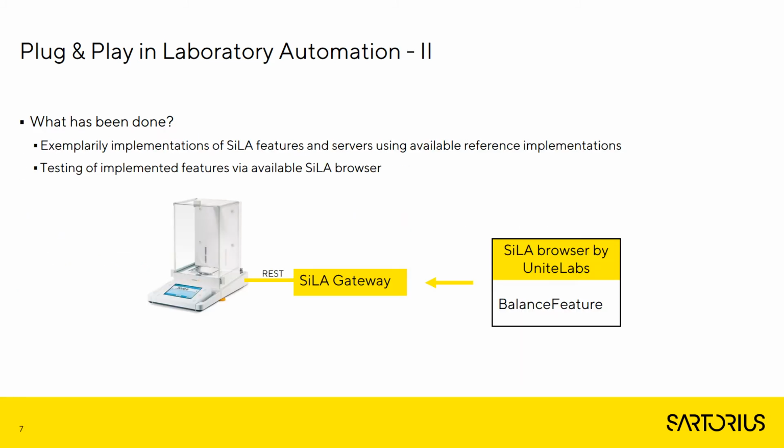In an initial approach to evaluate the SiLA 2 standard, we have established a SiLA 2 gateway for a couple of devices, which includes devices from our own portfolio, such as a balance, as well as custom sensors based on open hardware. These installations were established based on available reference implementations and evaluated using the SiLA 2 browser provided by Unite Labs.